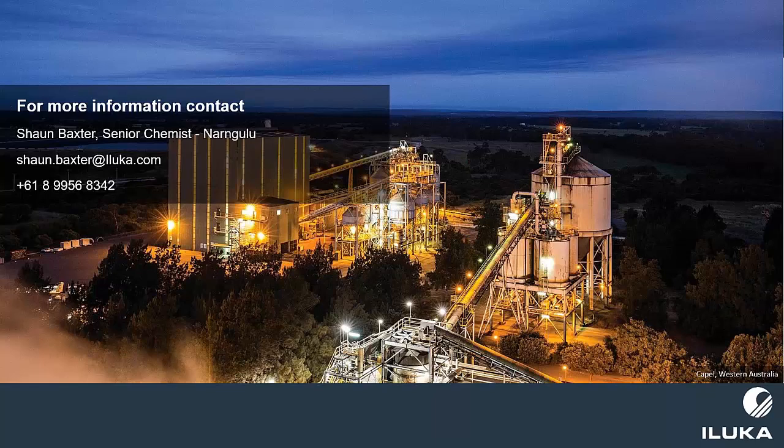David, how do you deal with the transition from the old system to the new system and that data? Because obviously you've got your initial data of the samples you have now, and how did you get that to marry? Sorry, Shaun. So the question was, how did they transition from using the older CCLAS system with the differing data names to the new CCLAS system?